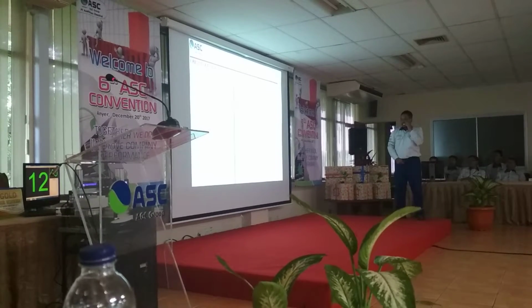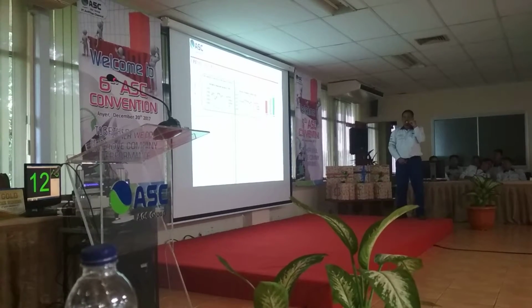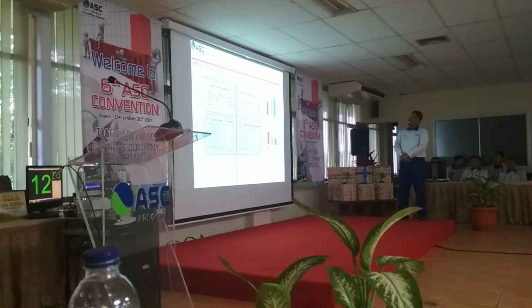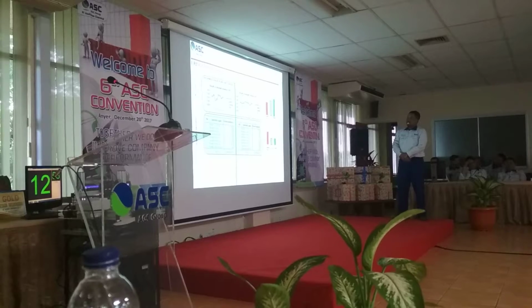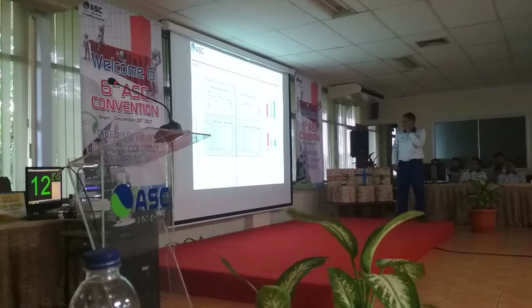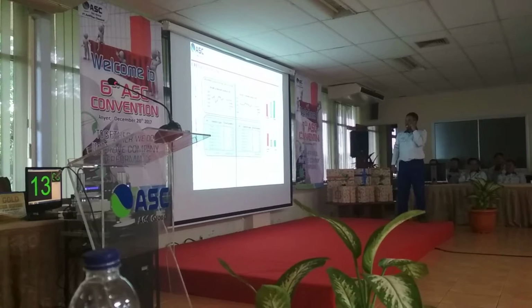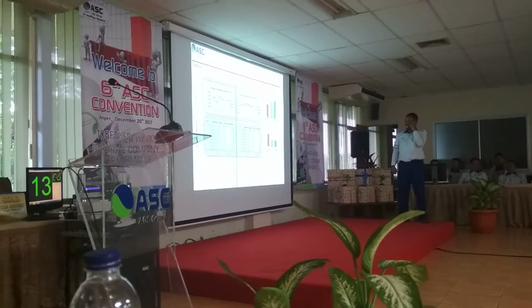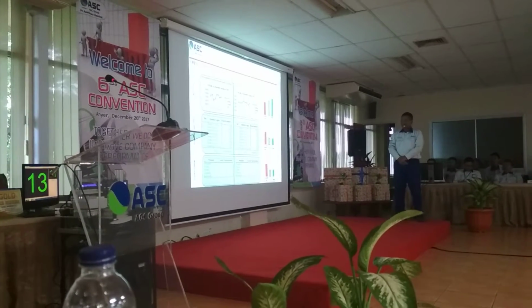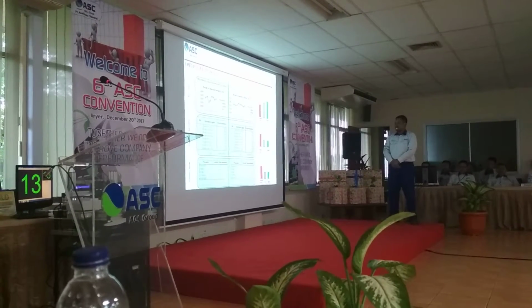This is an analysis device. We need to validate it. Is the analyzer for the fish eye ready to use or not? Initial condition is 85.4% accuracy. As the result, we can get 94%. For the standard deviation, from 4.9 in the beginning we get 2%. And the time before was 24 minutes, and we can reach 15 minutes.